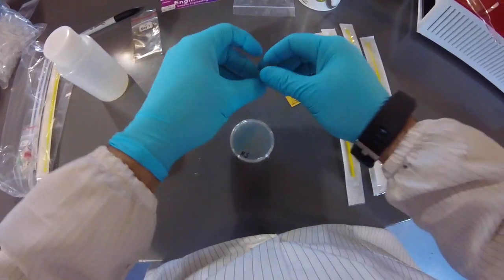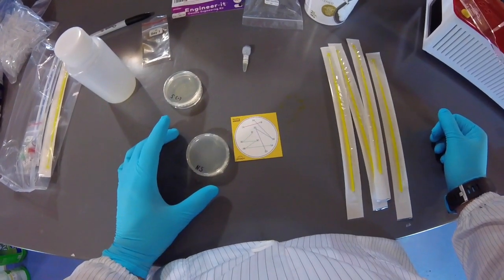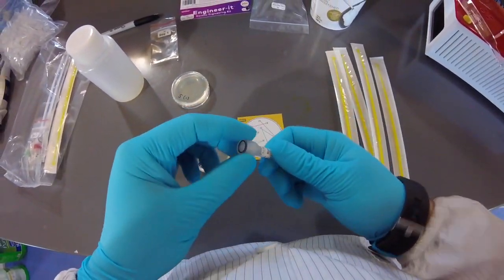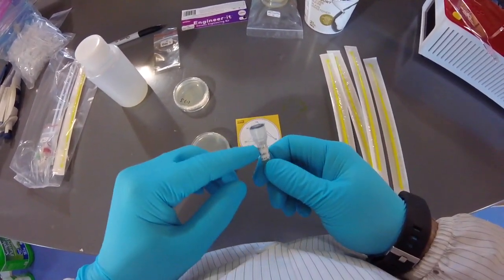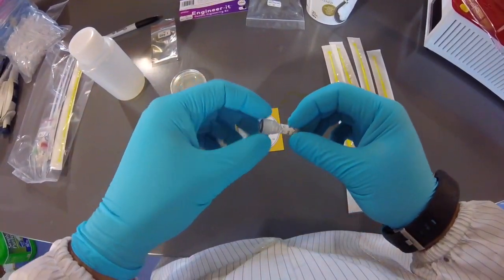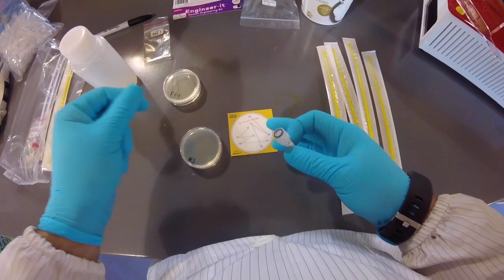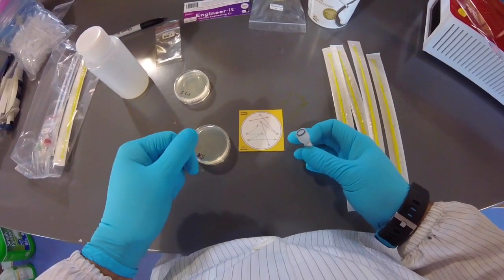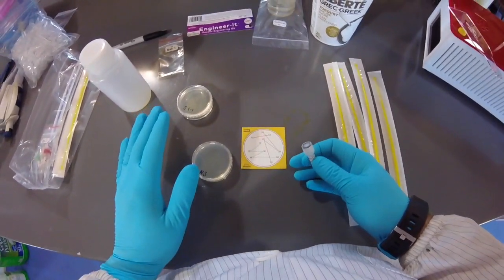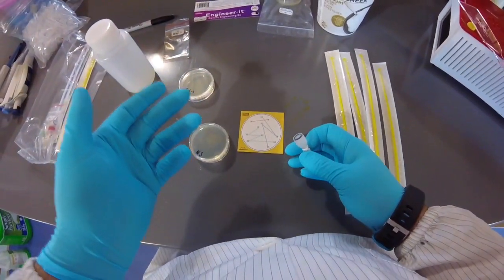So in order to get colonies of bacteria, we'll do what's called streaking, okay? Essentially, there's a lot of cells in here, mostly located at the top, so you don't need to dip or scoop anything out. As you'll see, you just need to dip a loop in, but the loop will be covered in lots of cells. If you put lots of cells onto a Petri dish, you just get a lawn, which is basically a thick layer of cells, all right? But we want colonies. We want these little mounds of cells because they take in DNA better, all right?